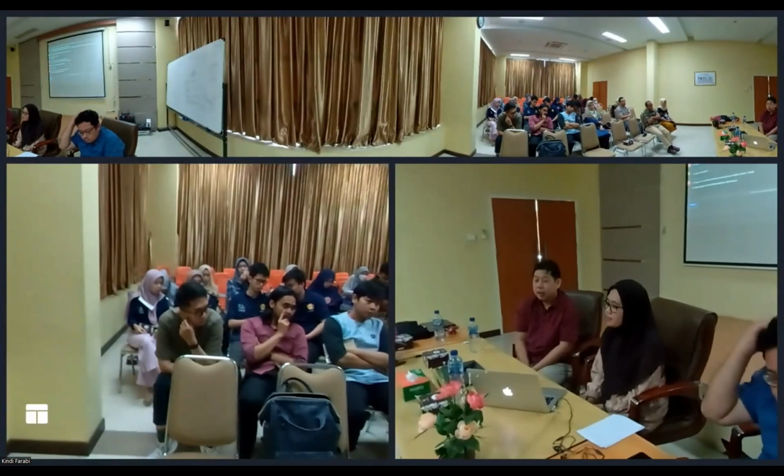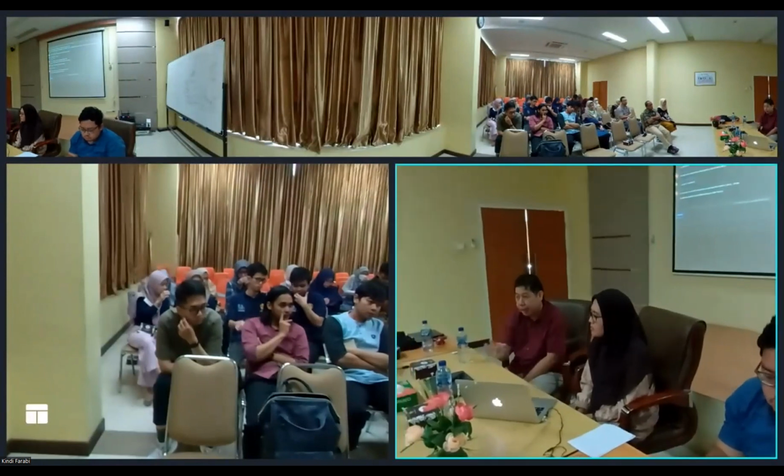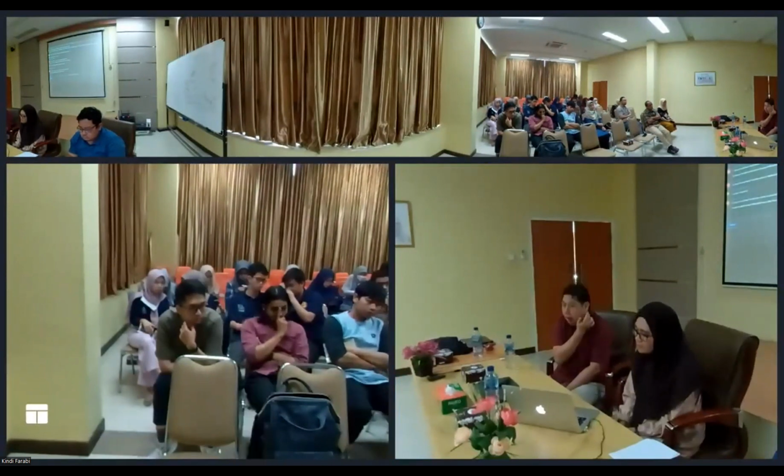Third question: what is the importance of the tolerance value in HRMS results? I think you are referring to mass accuracy. For time of flight, it will be around 10 to 20 ppm. But regardless of what technology you are using, it's very important that you always do a mass calibration before you do measurement. Only with that will your data be accurate.